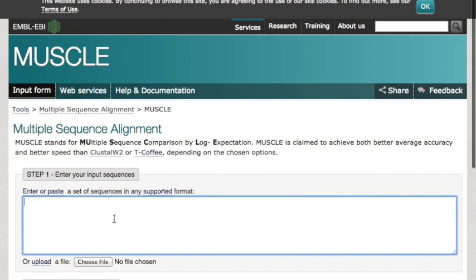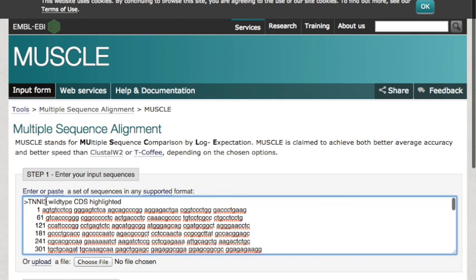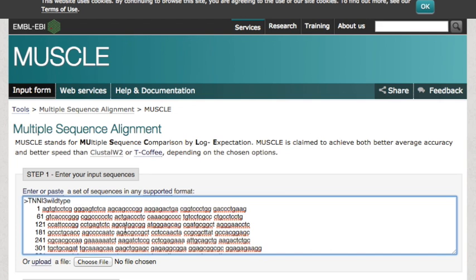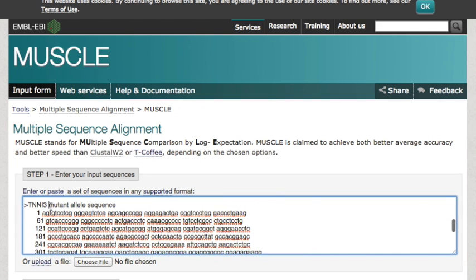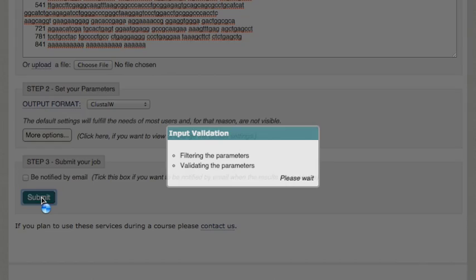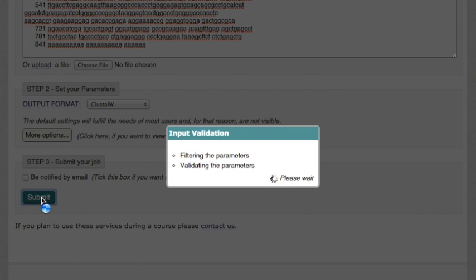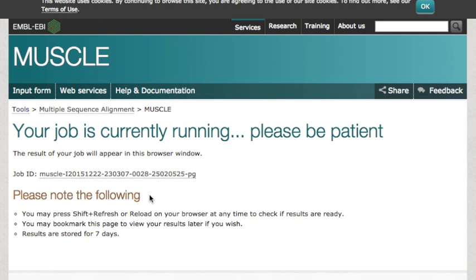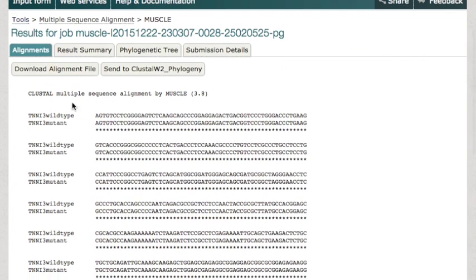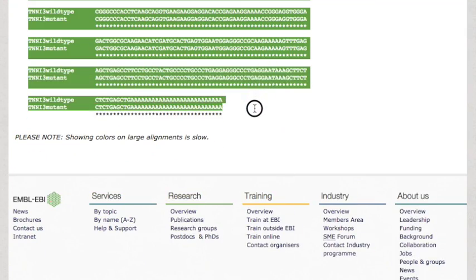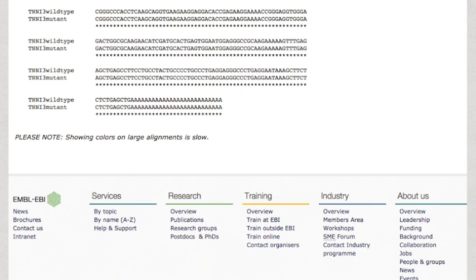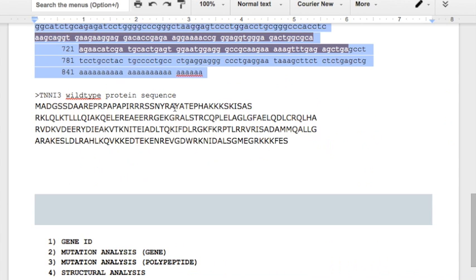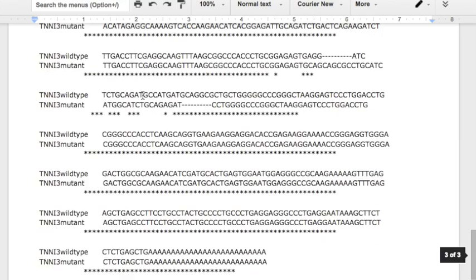Muscle is a multiple sequence alignment tool that may be useful for you. And I'll just have this as tnni3 wildtype is going to be one of the sequences I enter. And the other one is going to be tnni3 mutant. If I hit submit in just a few moments, it will align them in full. And here we go. I can take this entire thing, collect it, and paste it into my doc. And this will be a clustal alignment using Muscle. Here we go.